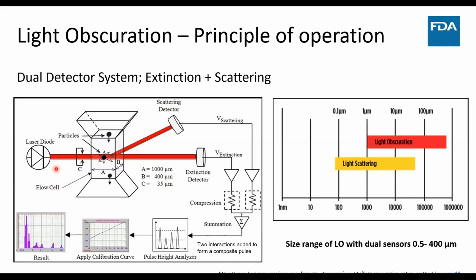In the past, where lasers were not very great, you could be looking at the lifetime of the laser, but these days lasers do really last a long time. So the lifetime of the laser might not be as great a factor. Another thing you want to look out for is, are we really getting the size that we intend? As I mentioned earlier on, we are applying a calibration curve that is using monospherical polystyrene particles.